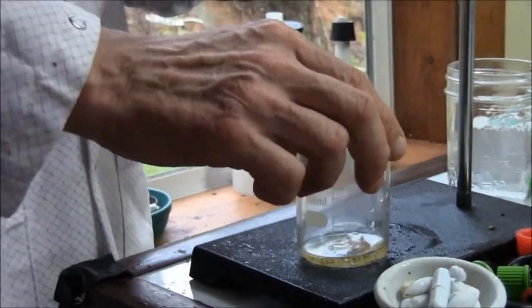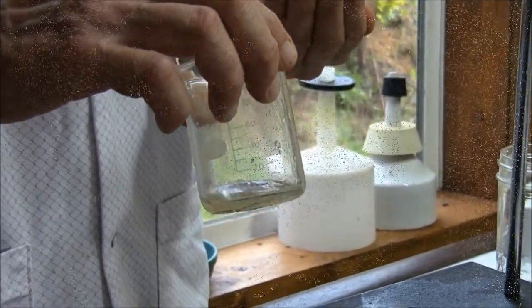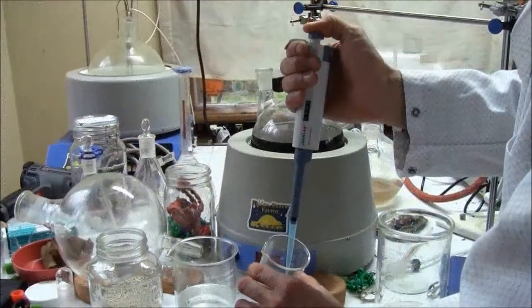Some of this molecular sieve. You can see how the water absorbs to the clay and that the oil is free of it.